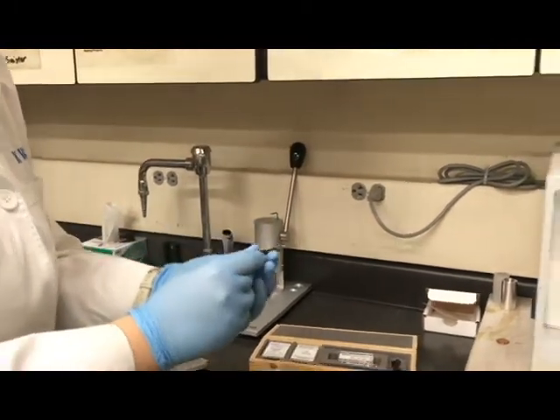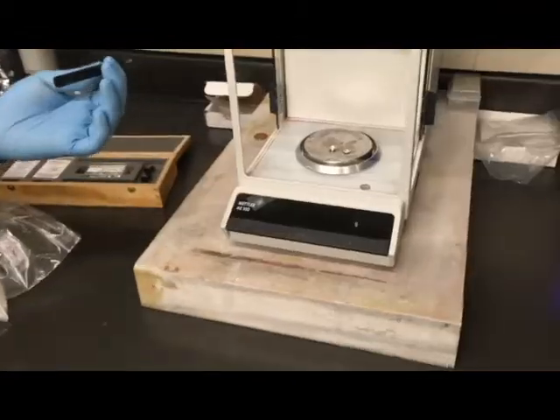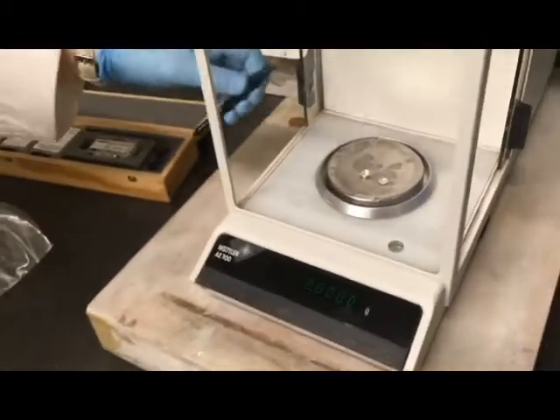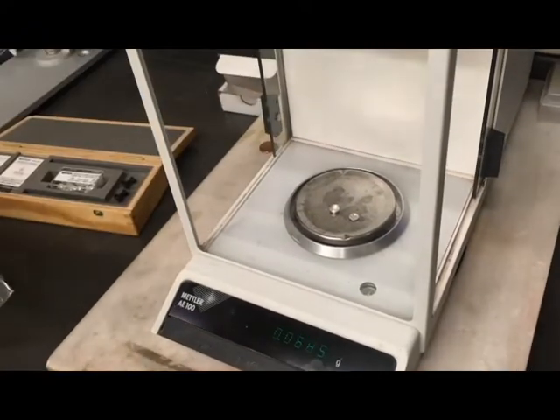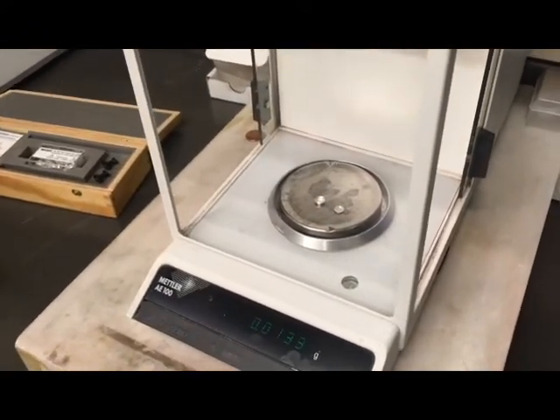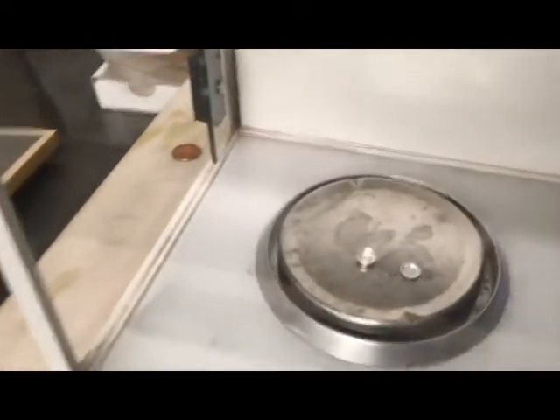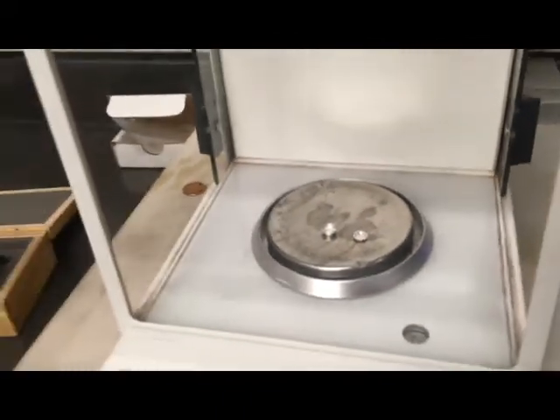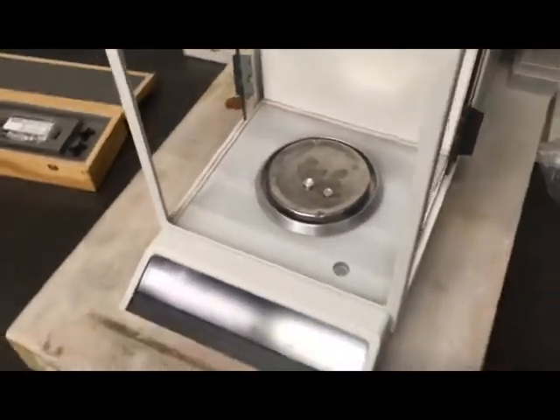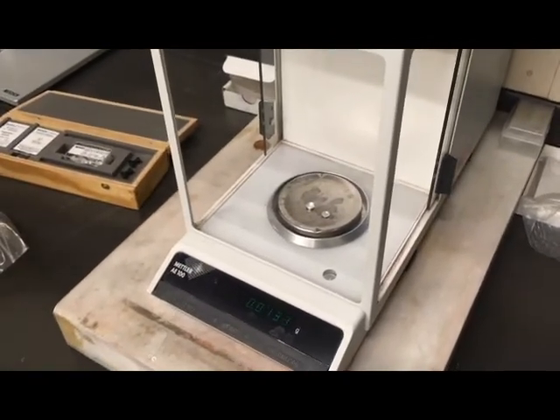What I would likely do is zero out the weight of the crucible — but you can also do the math if you'd prefer. I'm just going to place my pellet right in there. You can see my pellet is small enough that it's not sticking out above the lip of the crucible. You want to make sure it sits down in there, and when you put the lid on top, we want to make sure it's not going to deform the lid.